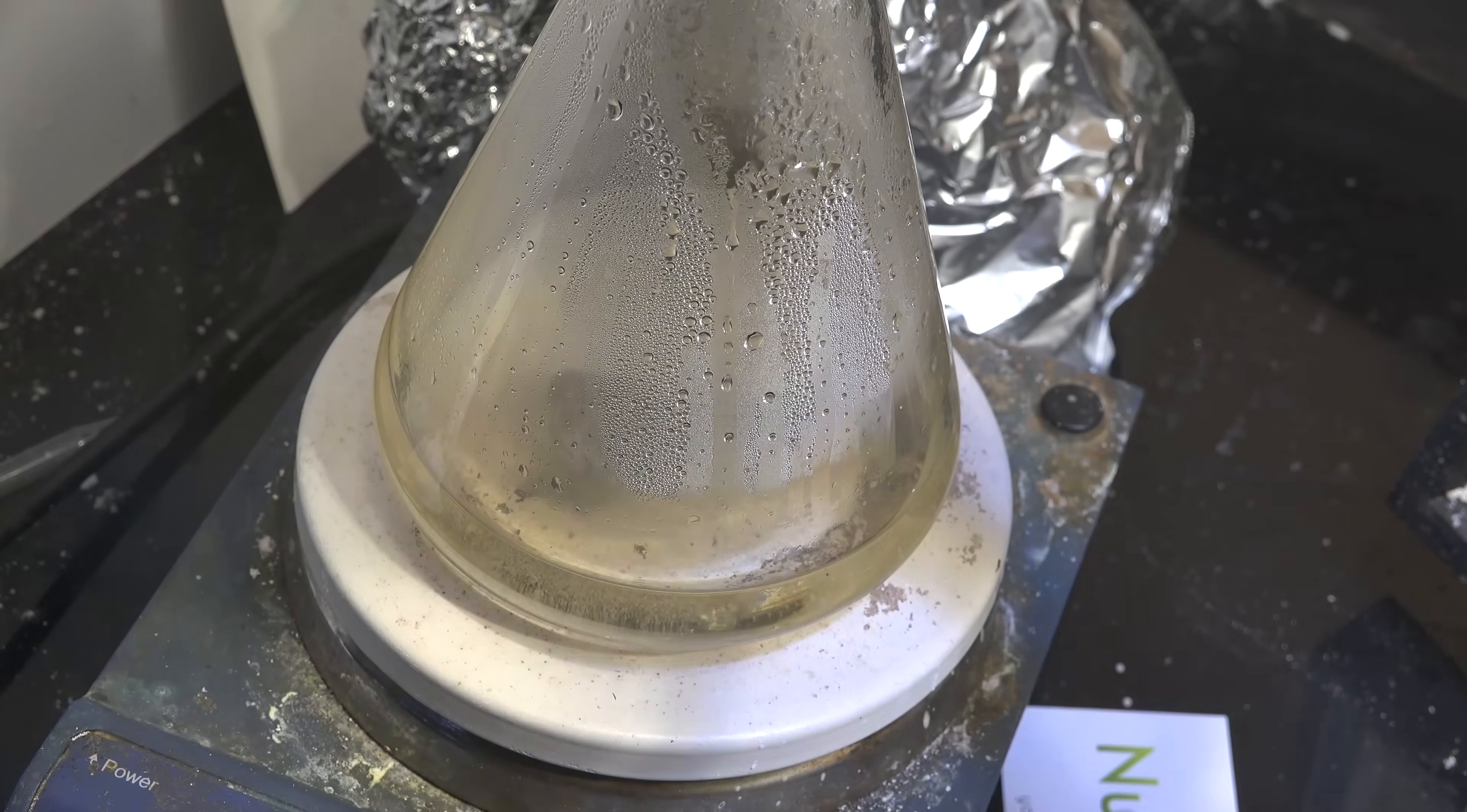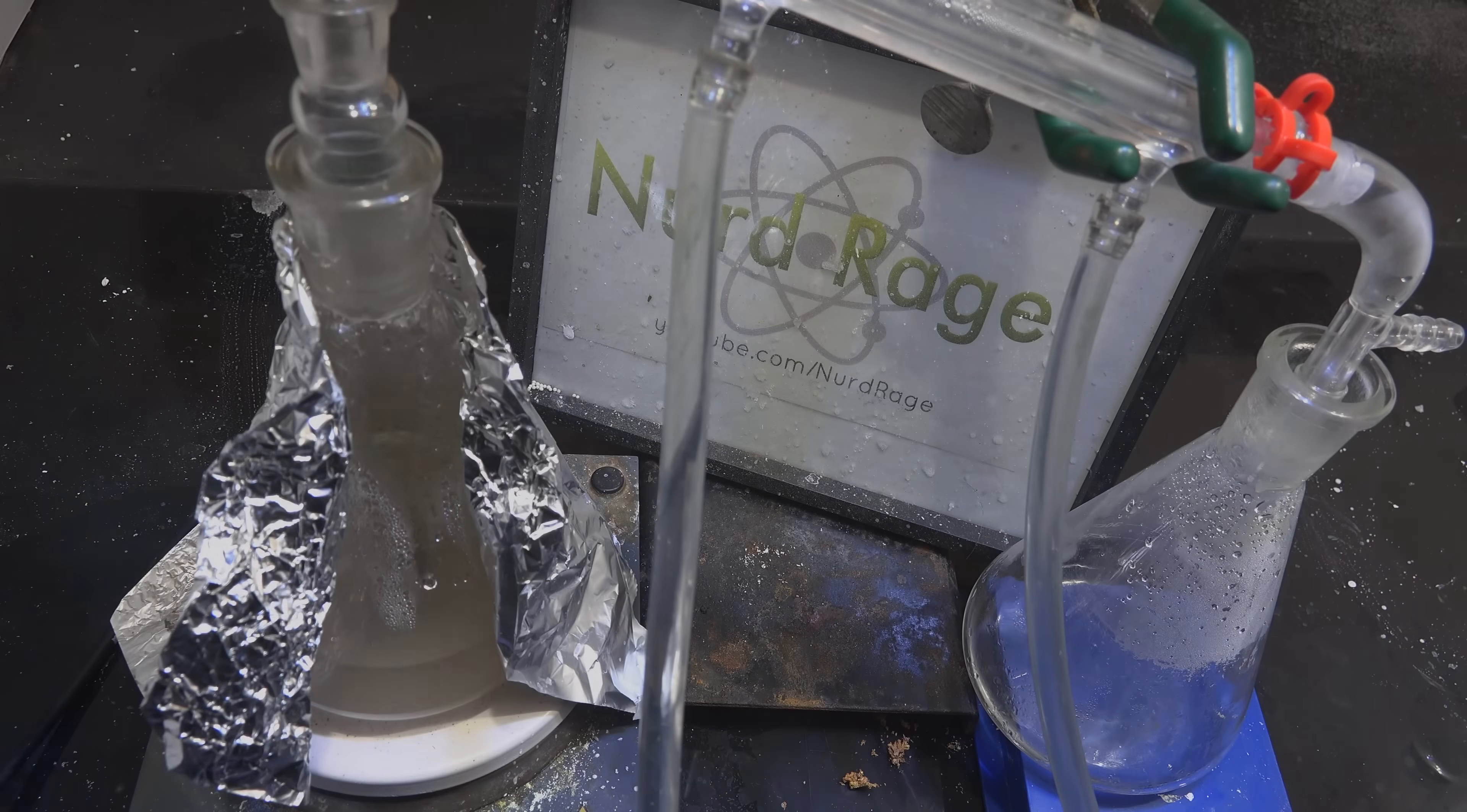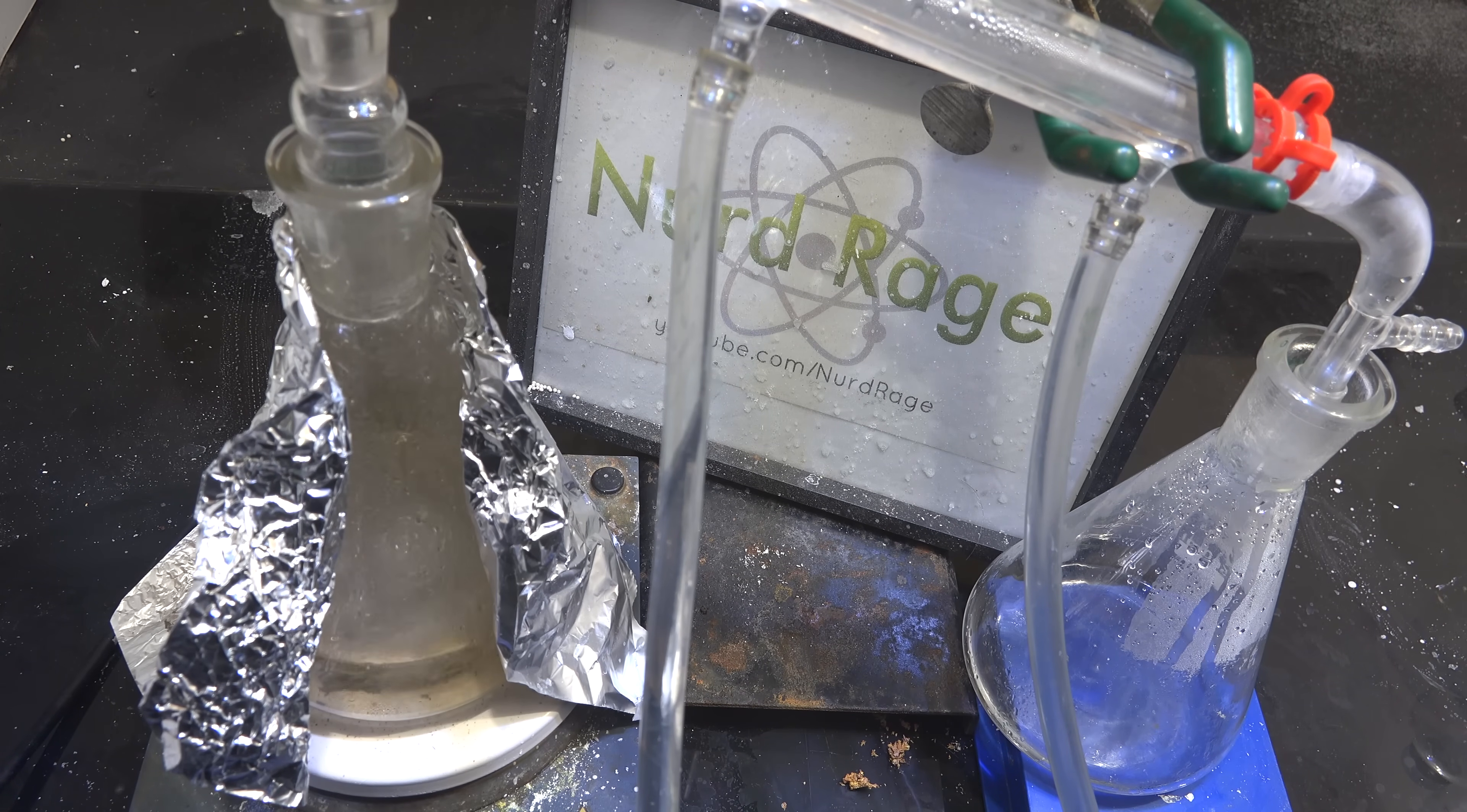Now let it cool and then add in another 100 g portion of oxalic acid dihydrate. Now replace the condenser apparatus and start heating again.